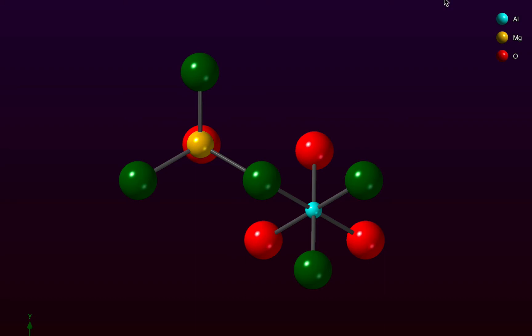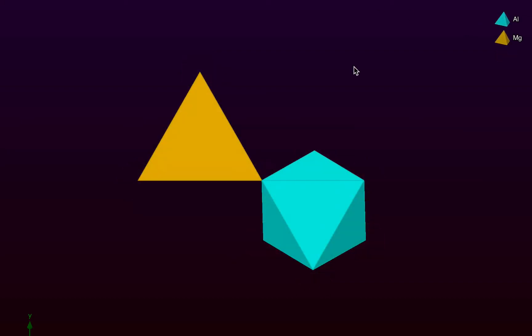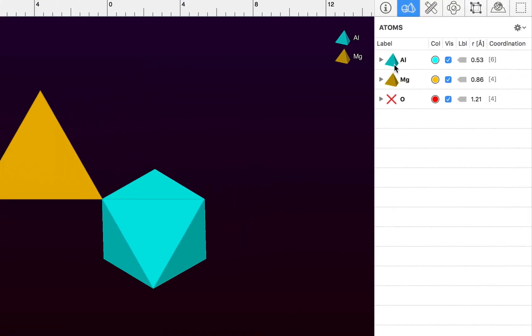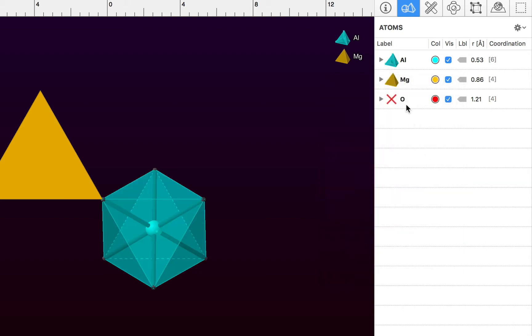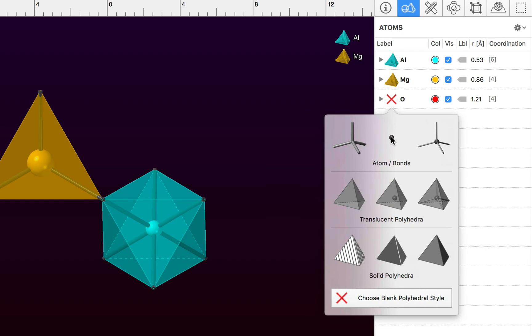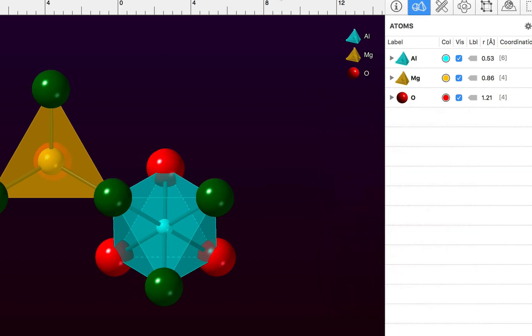So there we have our selected group of interest in this structure. We'll switch to a polyhedral model to emphasise that and I'm going to use the atoms inspector to choose translucent environments around those metal ions and I'll put the oxygen atoms on the corners of our polyhedra.